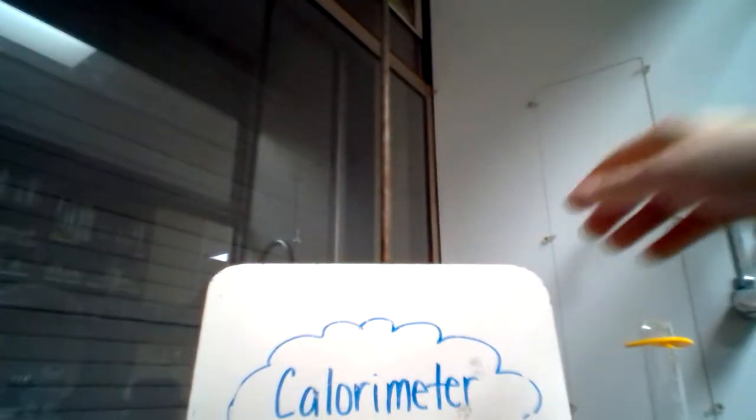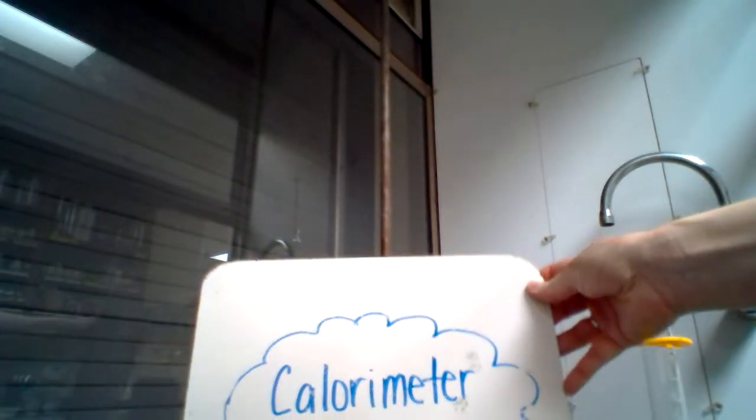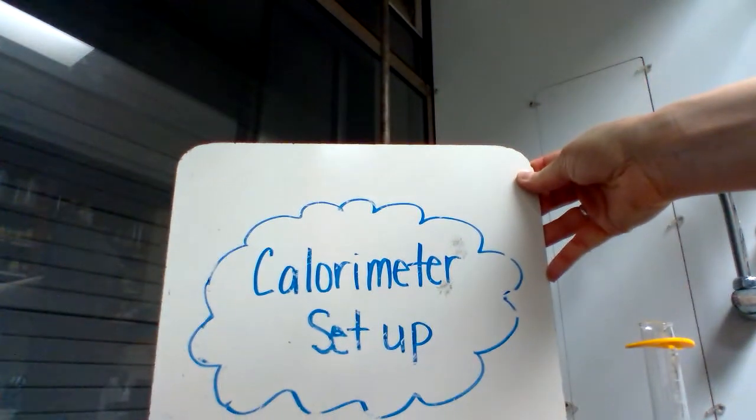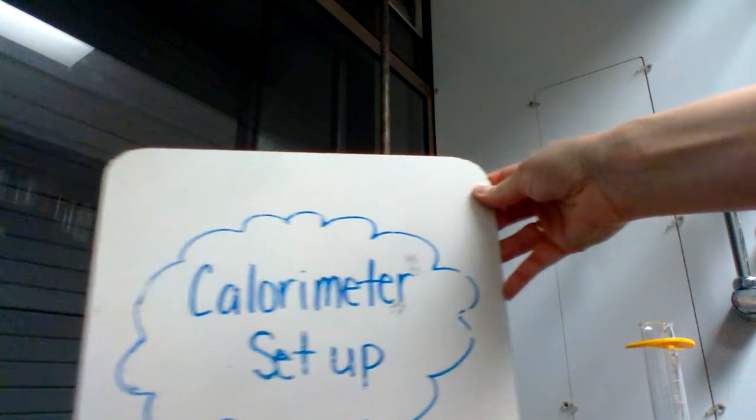All right, today I'm going to show you how to set up your calorimeter so you're ready to perform your lab.